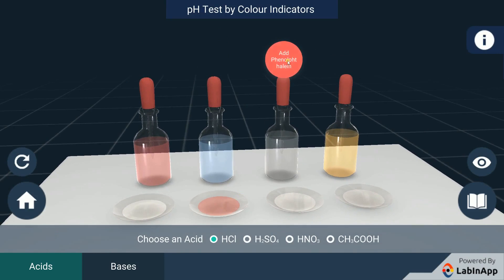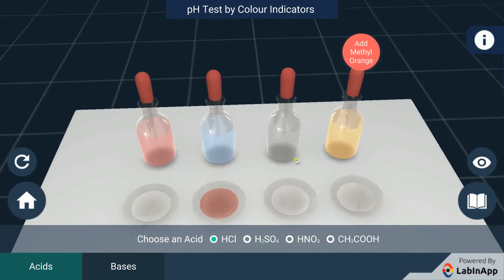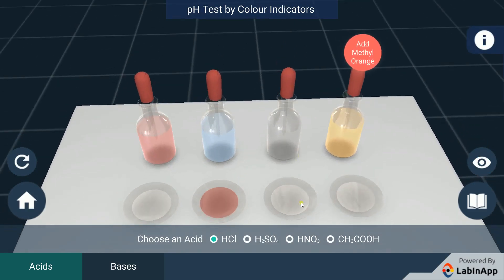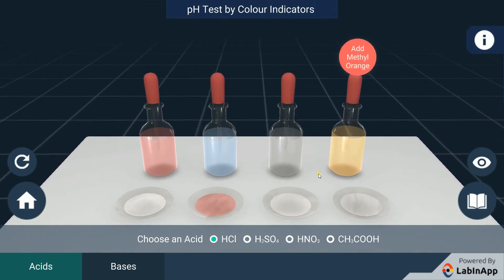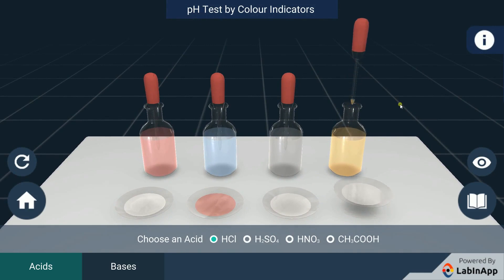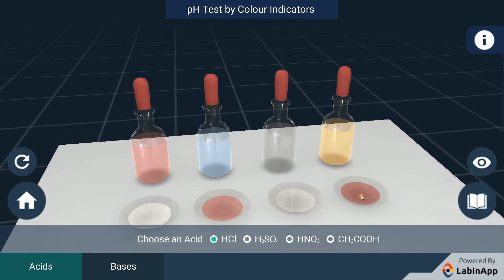Put phenolphthalein indicator in the third watch glass. We can observe that there is no change in color. Now add methyl orange indicator in the fourth watch glass. We see that the color of the solution changes to red.